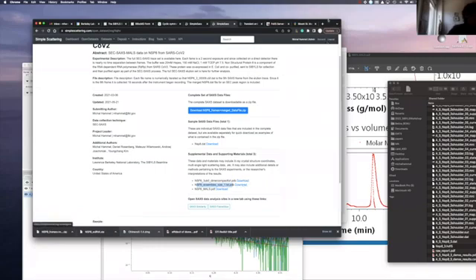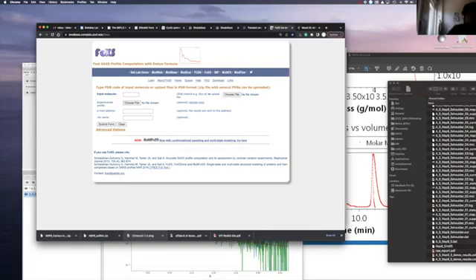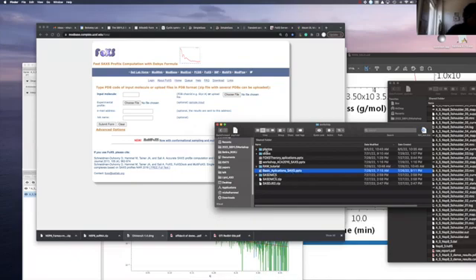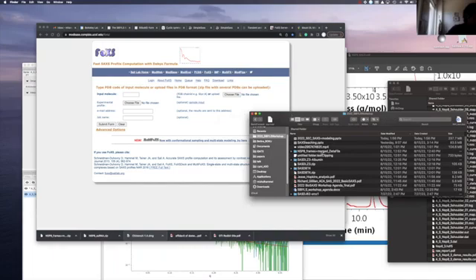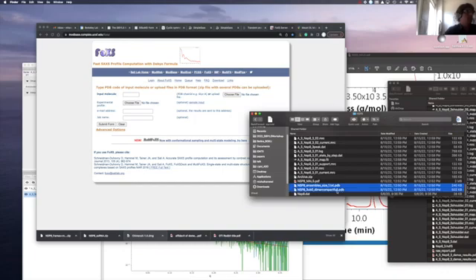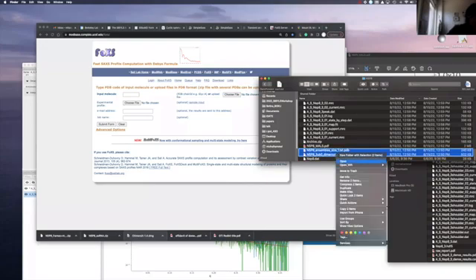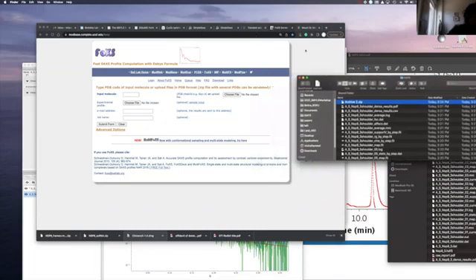If you upload them together to FoXS, and Dina didn't really mention that, but I want to do it now, let's just do that together. This is a different workshop, unfortunately. Here we go. These are the whole package, and here I have those PDBs number 1 and number 2. Those PDBs are available online. I will zip them together and produce a zip file that can be directly plugged in to the server.